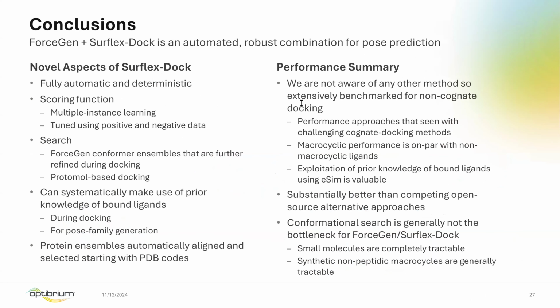So conclusions. Basically, Surflex-Dock actually works. It's automatic. You don't have to think a lot. You don't have to tweak parameters. You don't have to provide the right answer. You don't have to know the right answer in order to get the right answer roughly 80% of the time, looking at the top two poses that are predicted, pose families.